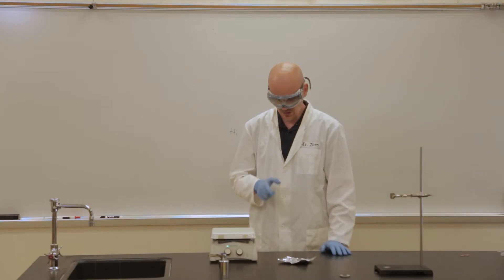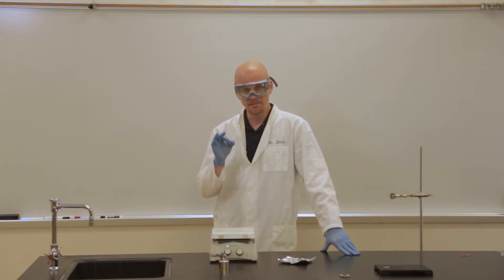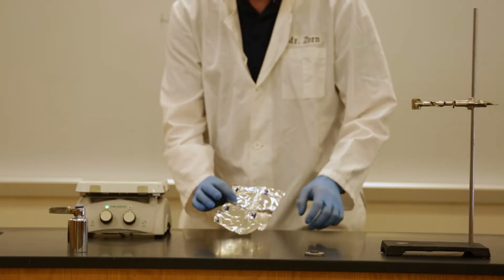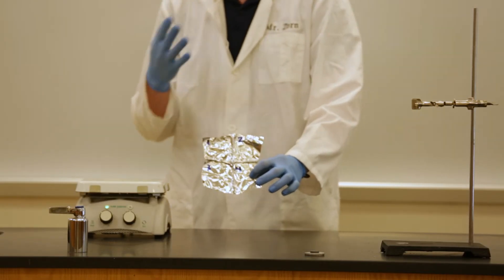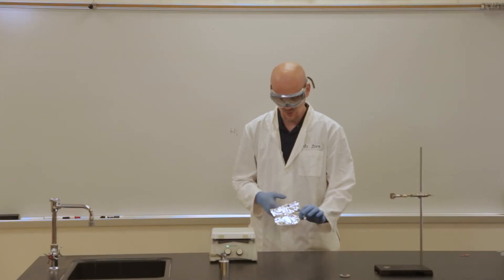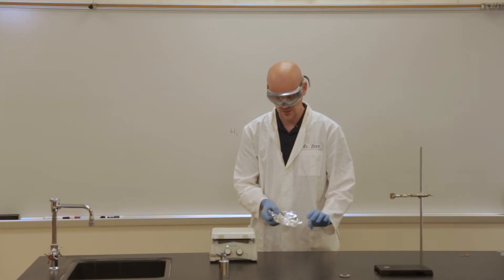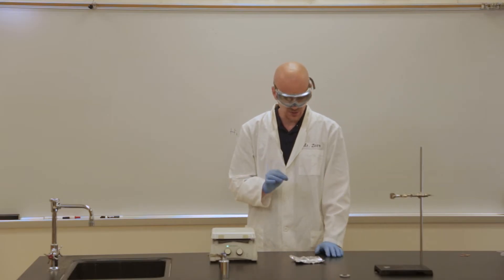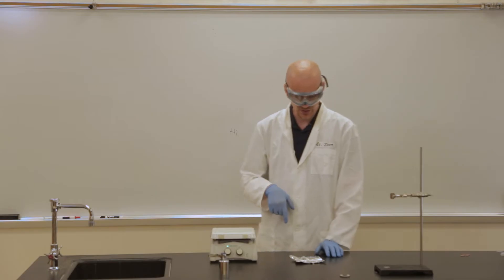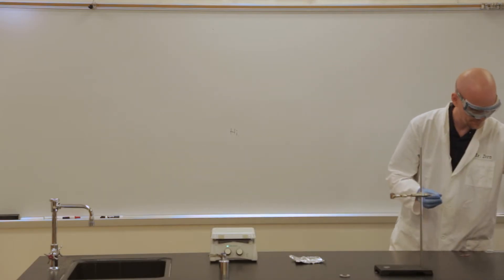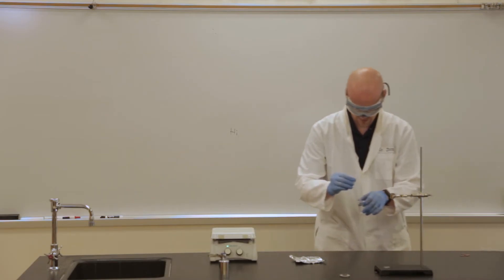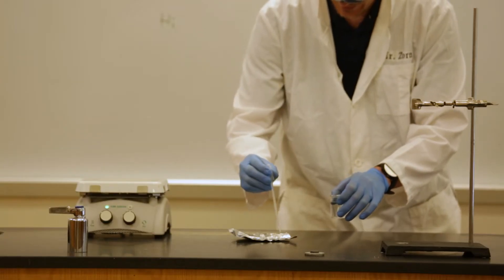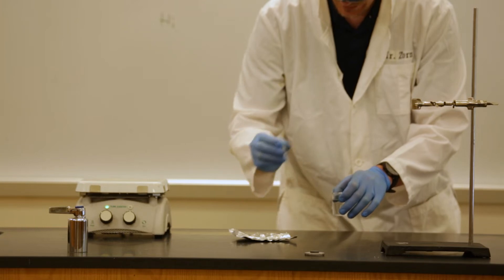The first thing we're going to do is test the boiling point of our four substances. I've taken a piece of aluminum foil and made a boat similar to what we did last time. I've cut it into four quadrants and numbered them. I'm going to go ahead and put a couple drops — let's do five drops — of each unknown in each quadrant.